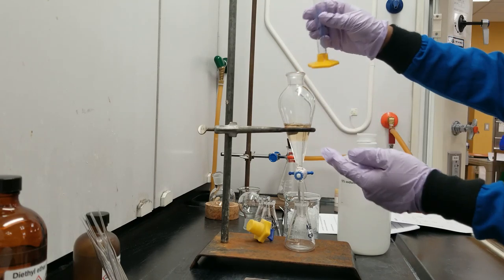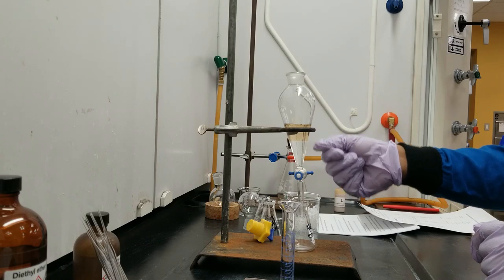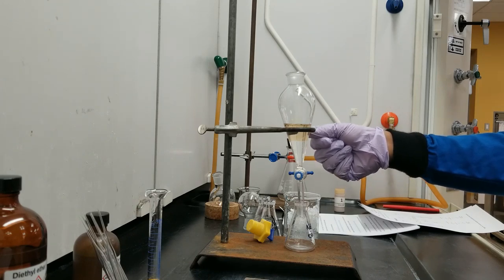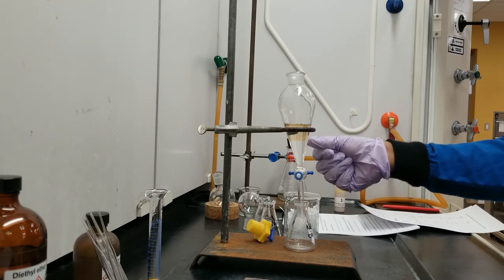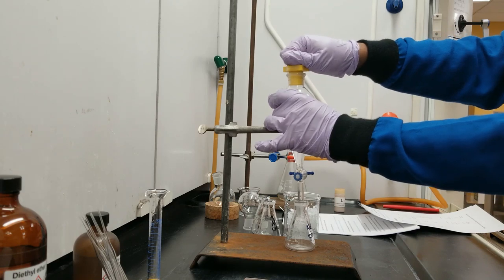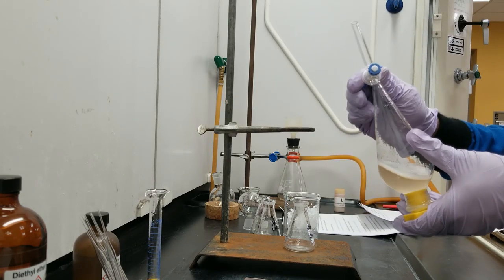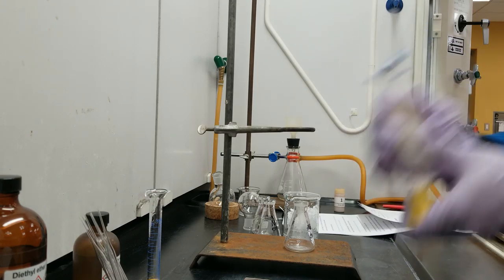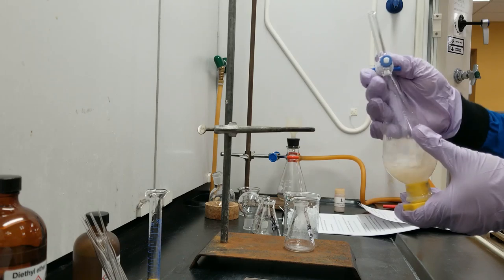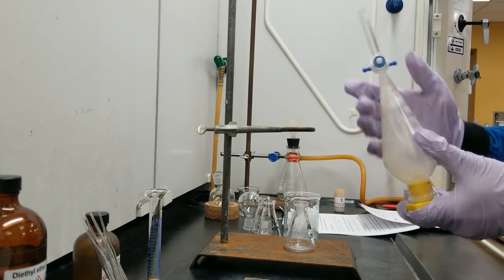And if you can notice, there are two different layers in the separatory funnel. The bottom layer is the water layer, and the top layer is the organic layer. They have two distinct colors. And now we will do the separation. So for doing the separation, we close the lid, we flip this thing, we shake it, and we vent it. We vent because there might be a buildup of carbon dioxide gas, and we vent off the carbon dioxide time to time so that there is no explosion while doing the separation.